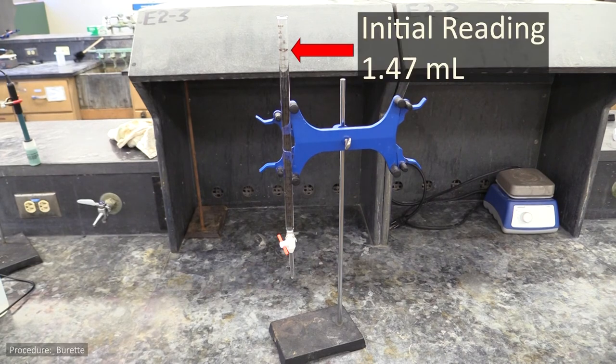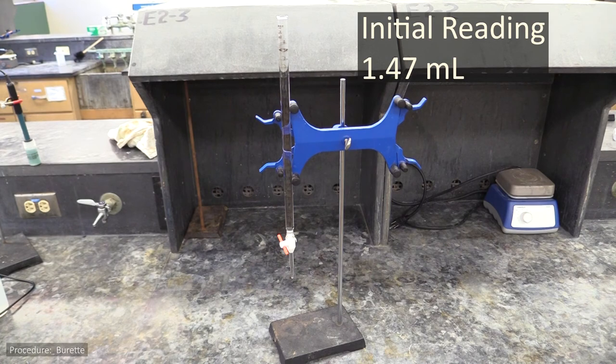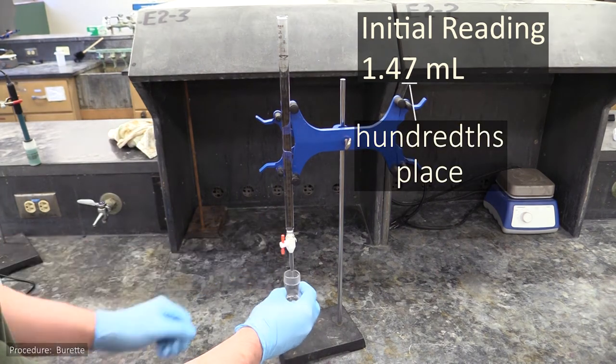Since the burette's physical markings go up in increments of 0.1 milliliters, you'll read to the nearest 0.01 milliliters, in other words, to the hundredths place, by interpolation.